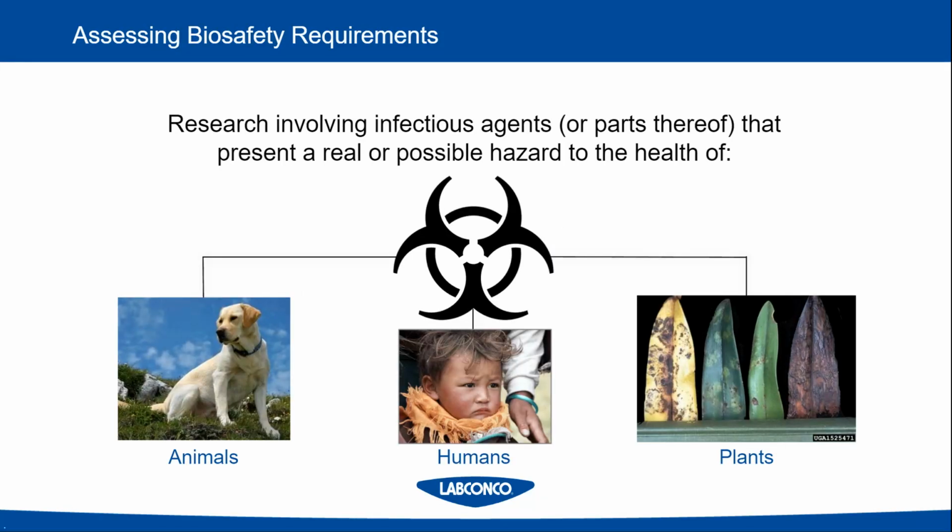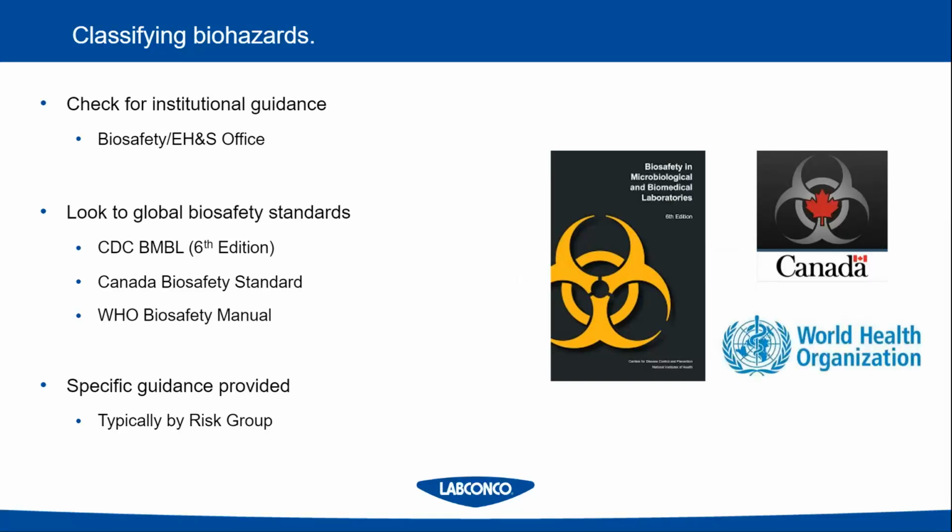What is a biohazard? It's a good question. A biohazard is any infectious agent or a part of it that presents a possible hazard to the health of animals, humans, or plants. This could be bacteria, viruses, other pathogens, and we classify biohazards in several ways.